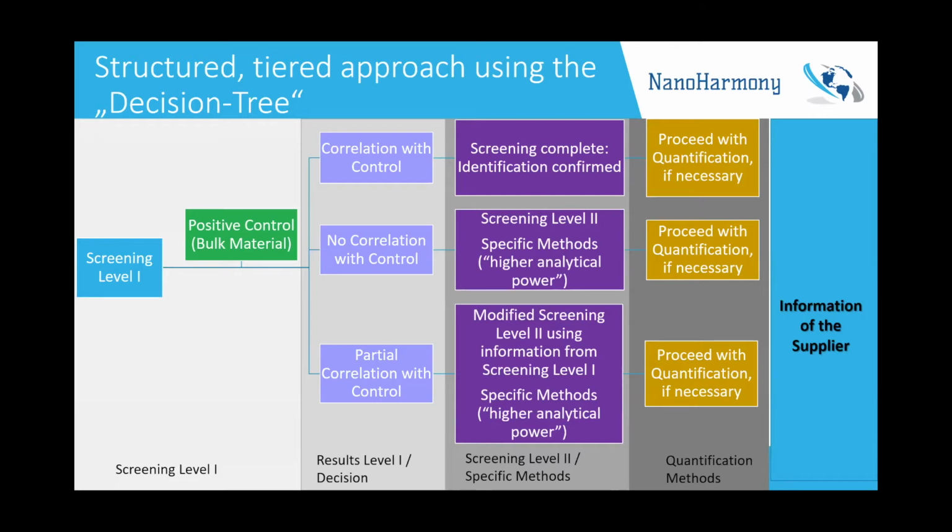In the last tier, you have the quantification methods, if that is needed, and you might select from the analytical toolbox whatever you think is appropriate for the material at hand.